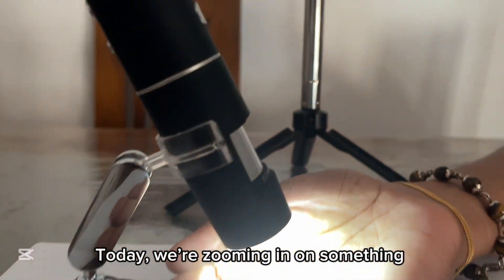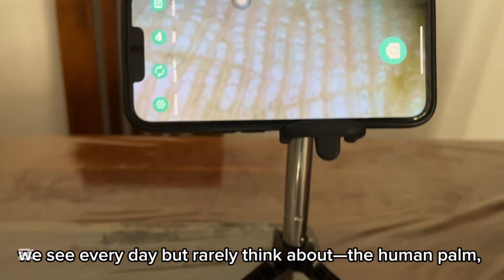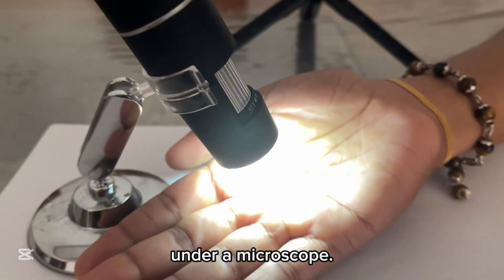Today, we're zooming in on something we see every day but rarely think about: the human palm under a microscope.